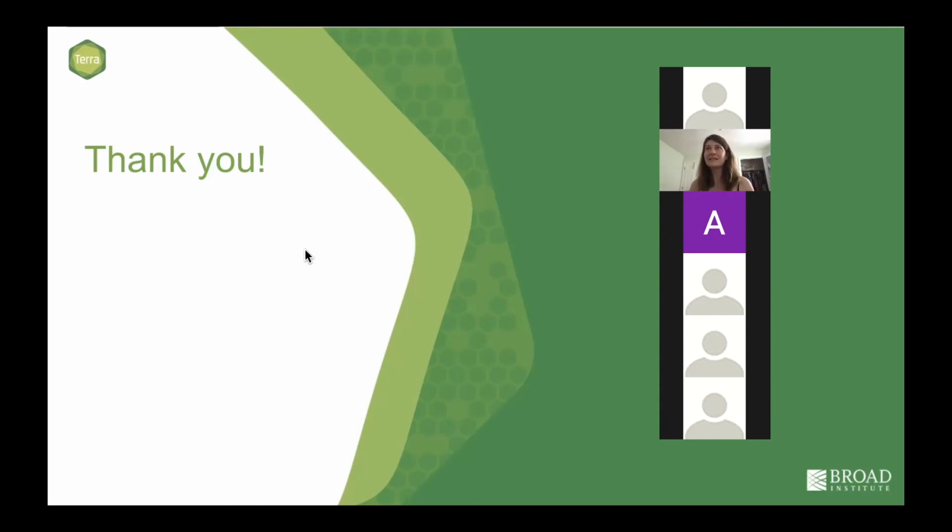And the nice thing is you don't have to wait for them to turn over. I mentioned that we have tutorials on how you can make a Docker image. You can pull in the software. You can update software in real time on Terra. You don't even need to make a new Docker image. You can just update software as you need when you're running those containers. So yeah, it does.